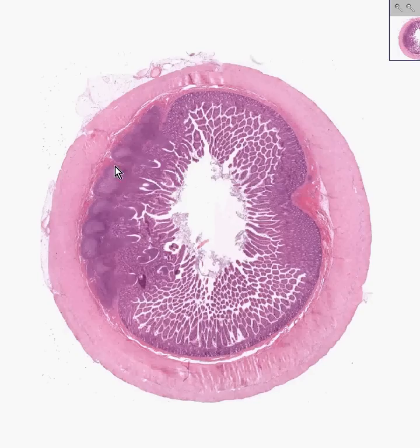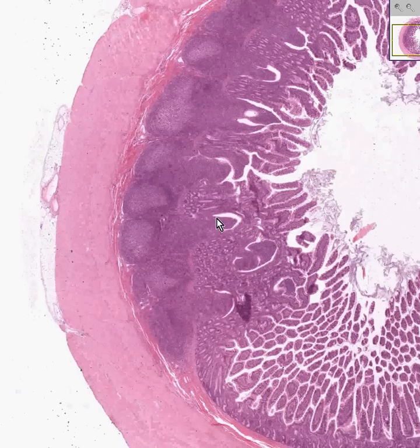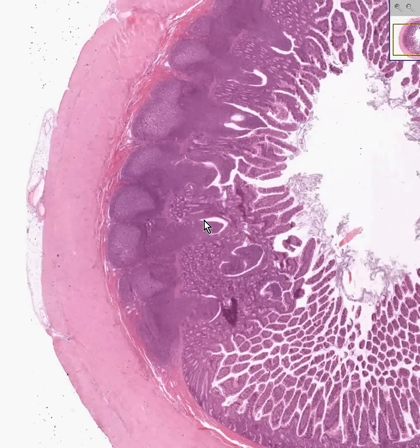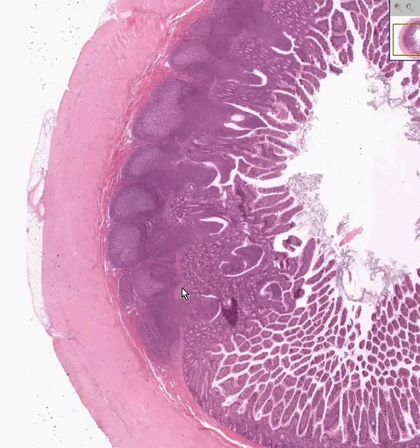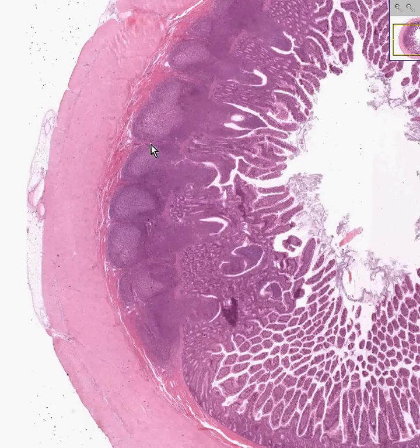Let's review the classical layers. I don't think it's really that important that we differentiate histologically between ileum and jejunum — there are just a few subtle differences. The jejunum has more submucosal infoldings called plicae, but the ileum has more lymphoid tissue in the submucosa, often referred to as Peyer's patches.